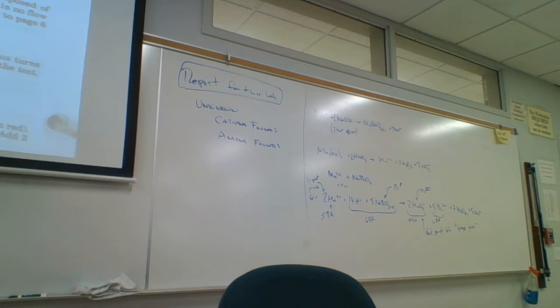This causes the formation of permanganate to stop, and dark brown manganese 4 oxide to form instead. If this happens, add more sodium bismutate and filter the mixture to see red-purple permanganate. So you're just going to keep looking for red-purple liquid. It could be on the surface of the solid or somewhere. Even if we see a brown precipitate, we're going to keep trying to get it.